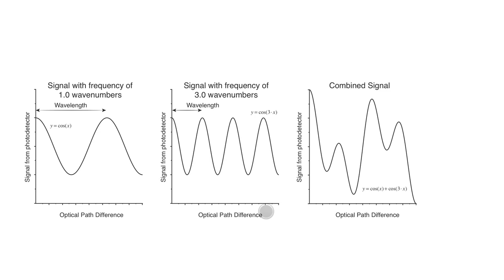Well, it contains most of the information we're interested in. Also below 500, we kind of run out of materials that will let IR pass through them easily. So instruments that look below 500 are much more expensive and use different techniques to measure the IR radiation. Above 4,000, not a lot of really useful information. And again, we'd have to actually change the source because our IR source isn't producing wavelengths much above that. So you've got to go to a different instrument there. But there's the near IR, the far IR. Those are all important regions of the spectrum to look at when you're looking at molecules, especially if you're an astronomer and that's all you've got. But in our lab, our instrument looks at the mid IR, which is 500 to 4,000 wave numbers.